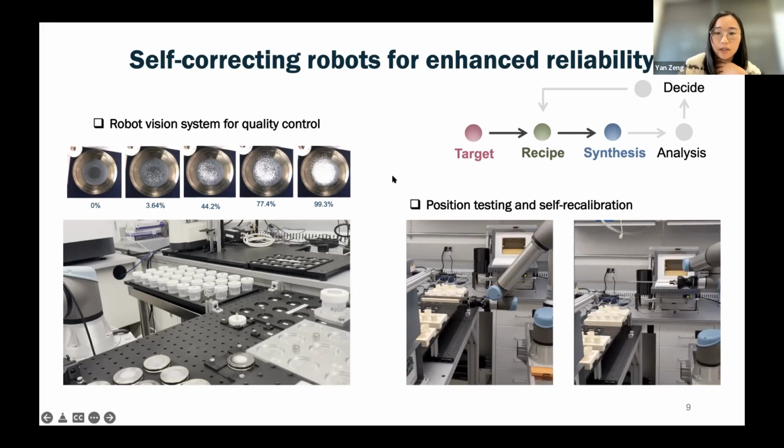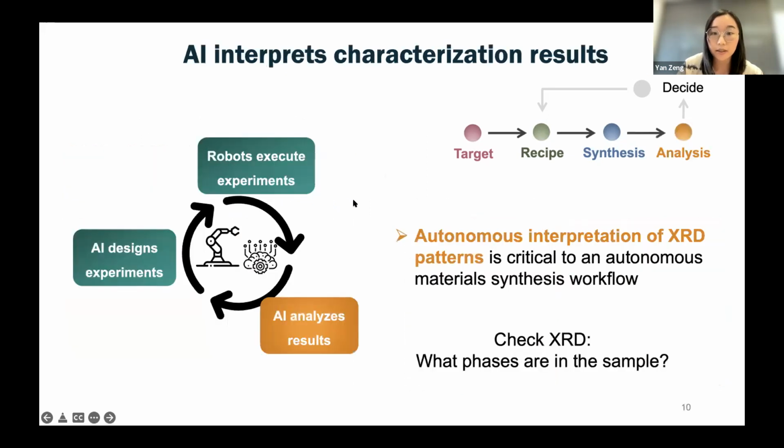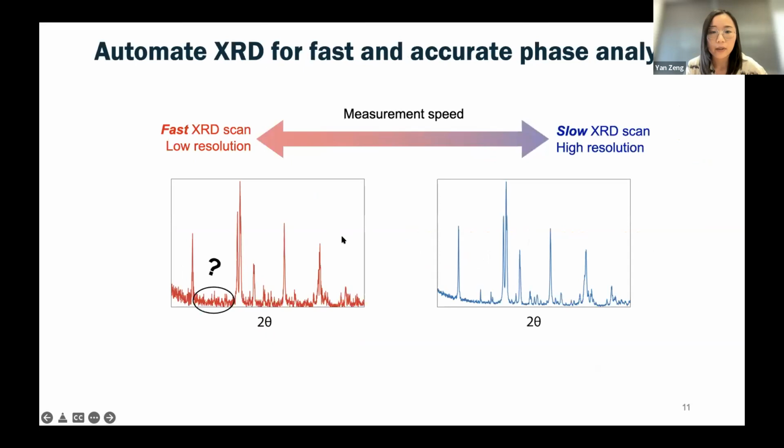Okay, so here's just some examples of this setup. Once this is done, what we have is raw data from XRD patterns, and usually we use commercialized software to analyze this. But since we are aiming for high throughput and a fully autonomous workflow, it's important to have models that can help us analyze the data, in this case XRD, on the fly with high confidence. So I'm going to go through briefly how our machine learning model works for this case.